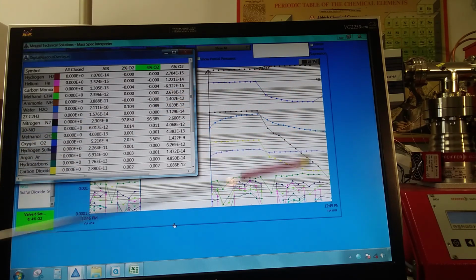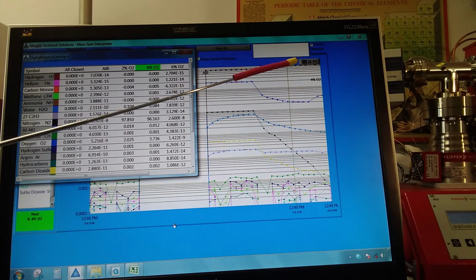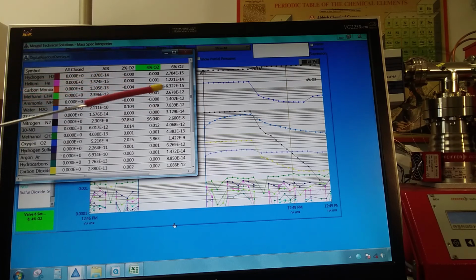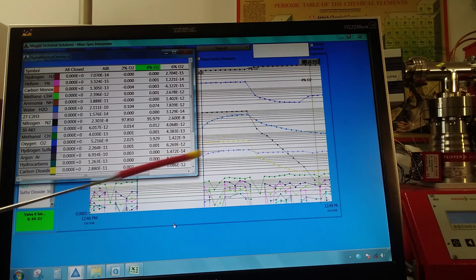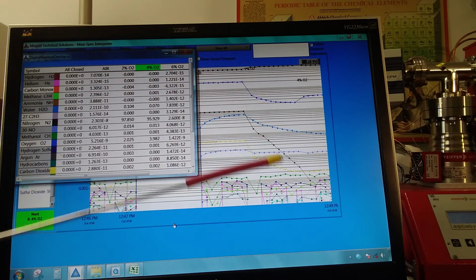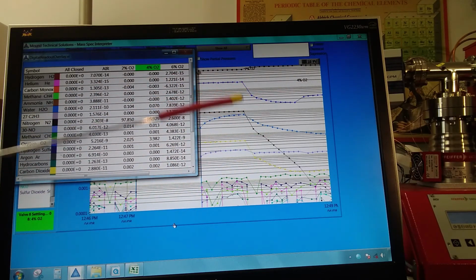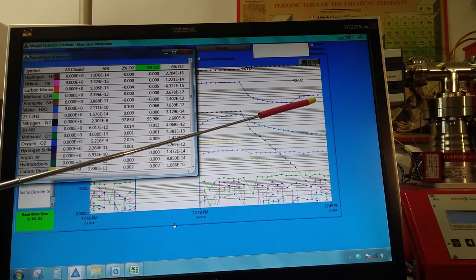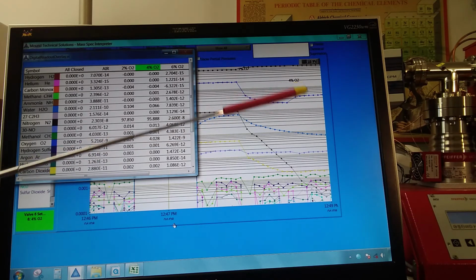These plot points are expressed as mole percent on our 5-decade logarithmic scale. And you'll see the same data expressed in digital format as we cycle through and fill in the appropriate data. So right now we've transitioned from our 2% to our 4% gas standard.